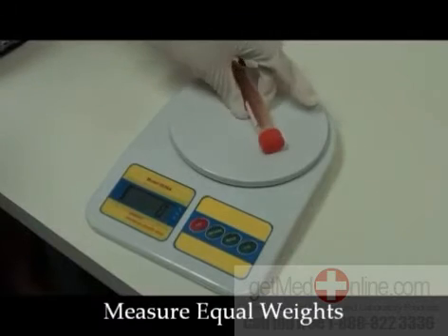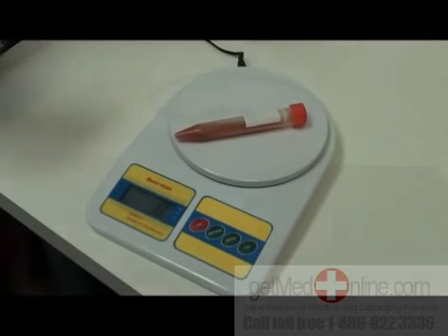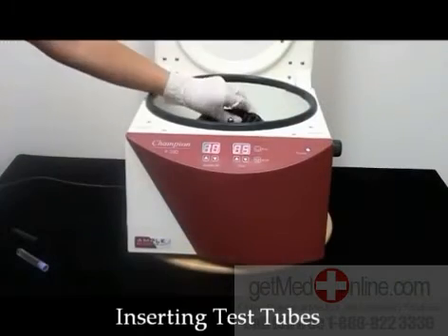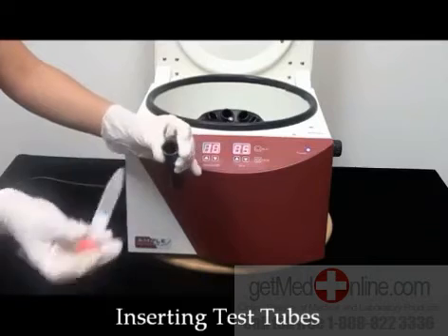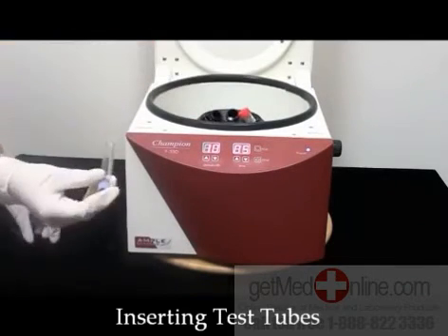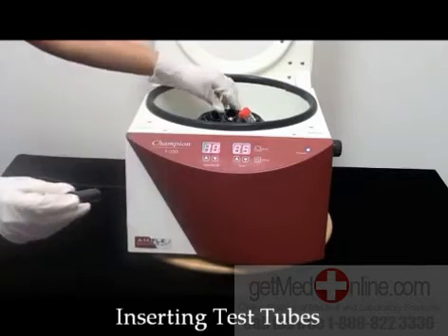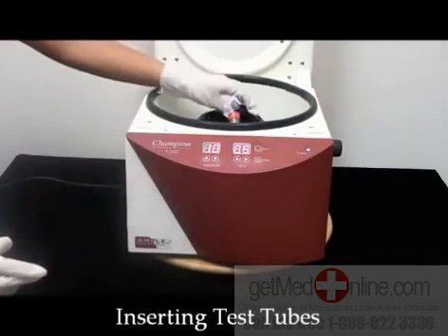Measure your samples to make sure they are of equal weights. When using the 15-milliliter tubes, be sure to put in the rubber inserts before you insert the test tube into the large buckets. To use the 7-milliliter, insert the test tube into the smaller tube holders and then into the 15-milliliter buckets.